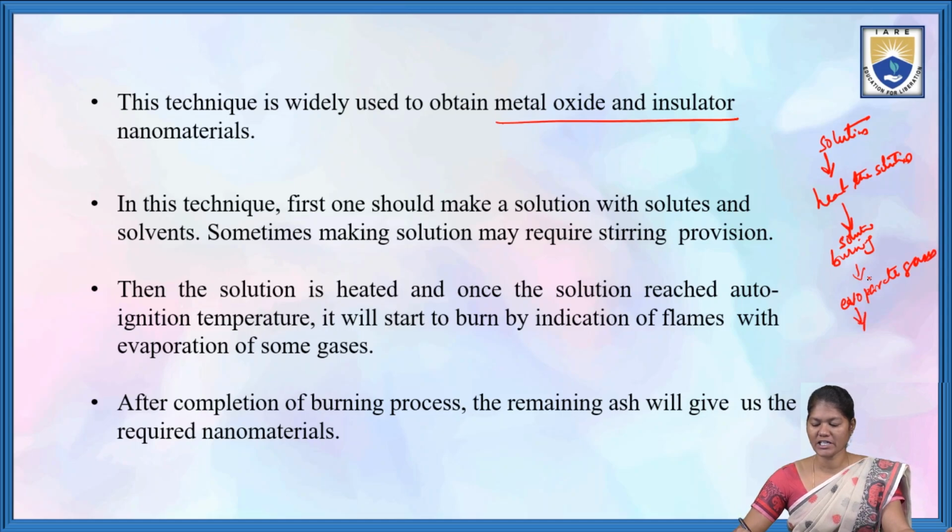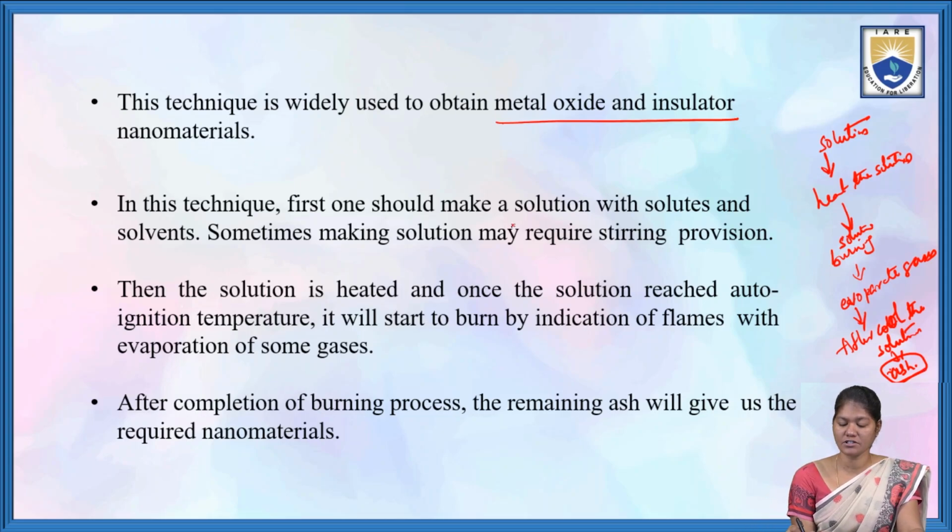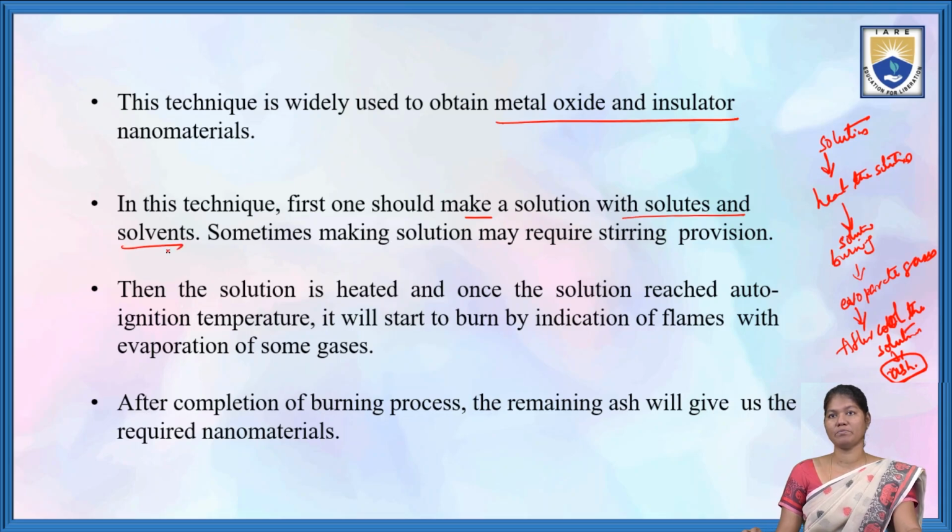So after cooling this solution, we'll get a remaining product, that is, the remaining ash will give us the required nanomaterials. So in this technique, first we should make a solution with solute and solvent.